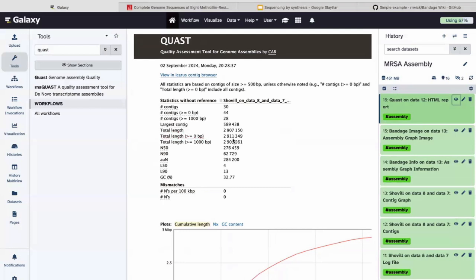And it is quite close to the genome size given in the paper by Higuchi and colleagues. And the GC content is also pretty much similar to the output from fastp. So these results are coherent with expected results.